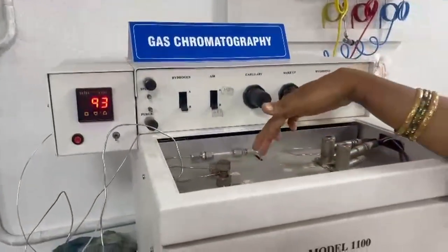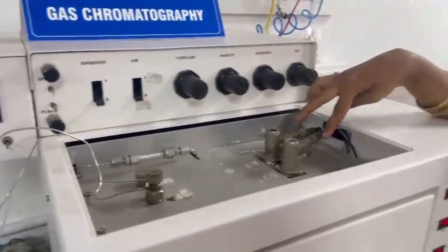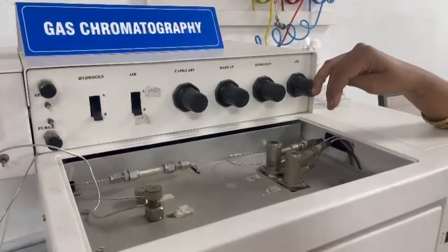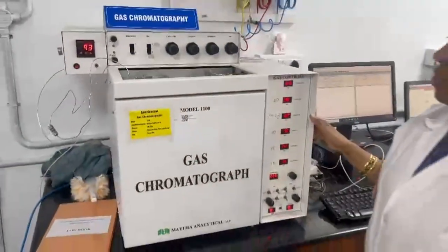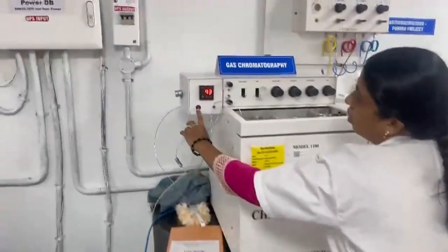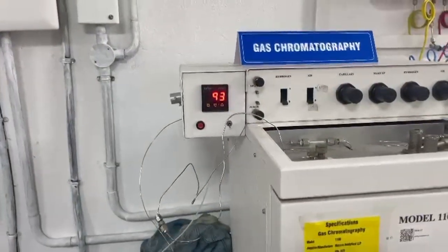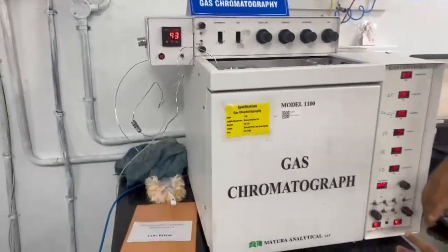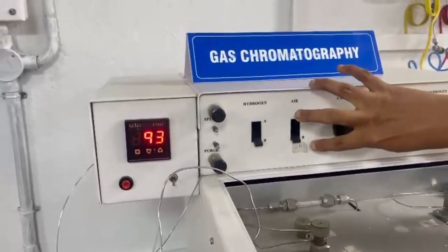We have two injectors going separately to the two different columns, and we also have two detectors, an FID connected in parallel with a TCD. We have a timer setup here for switching from one packed column to another packed column. We also have injection facilities for injecting in liquid mode and also in gas mode.